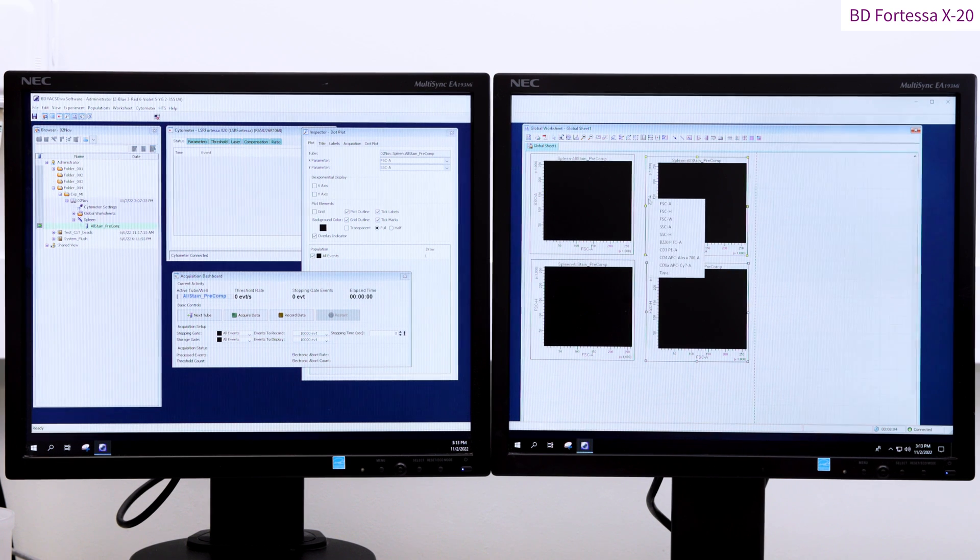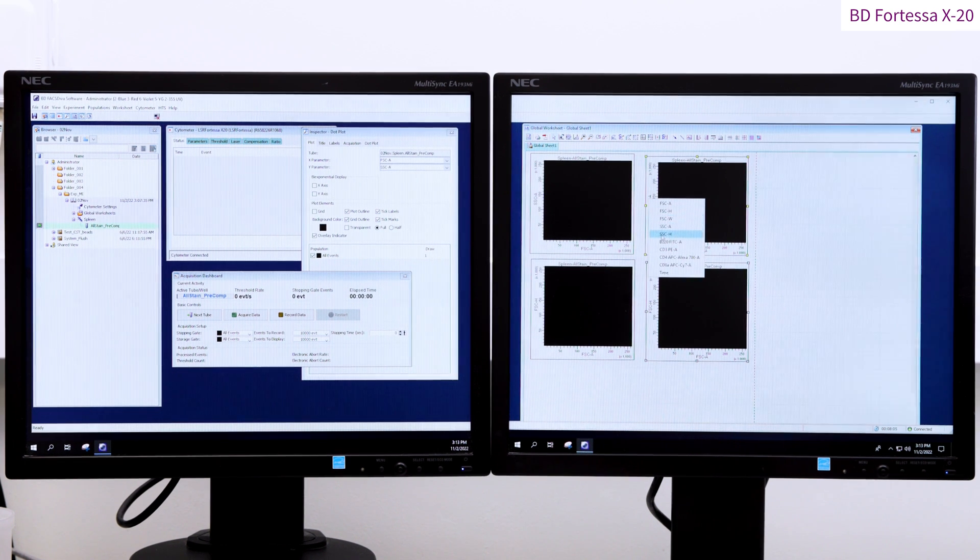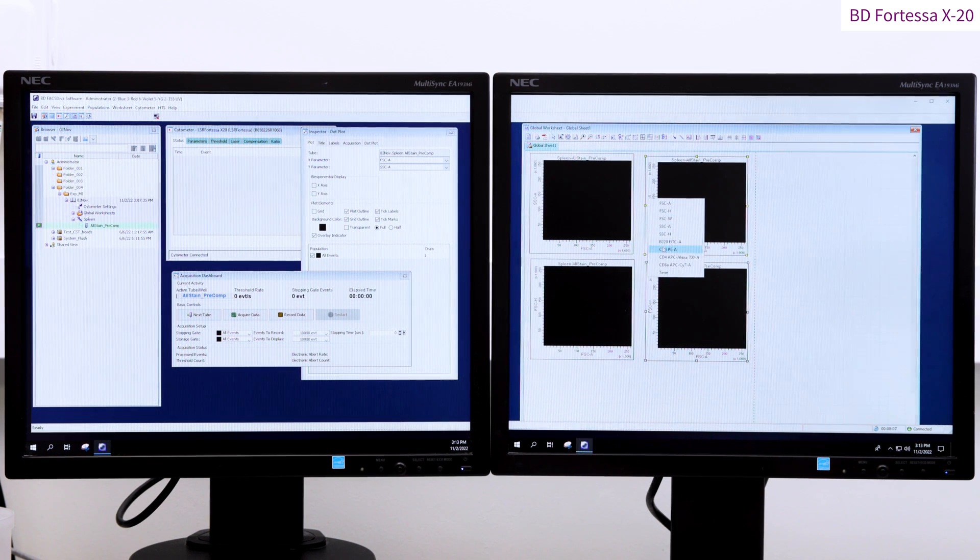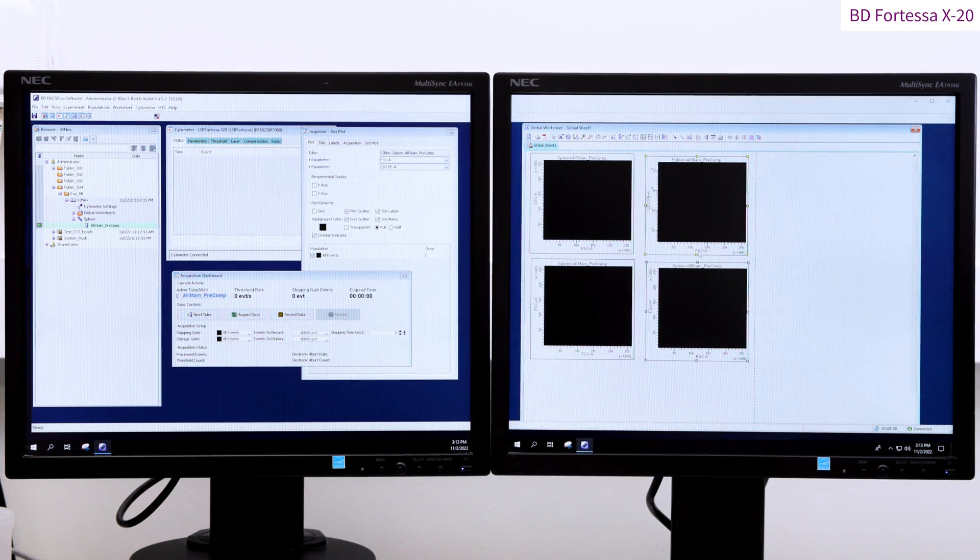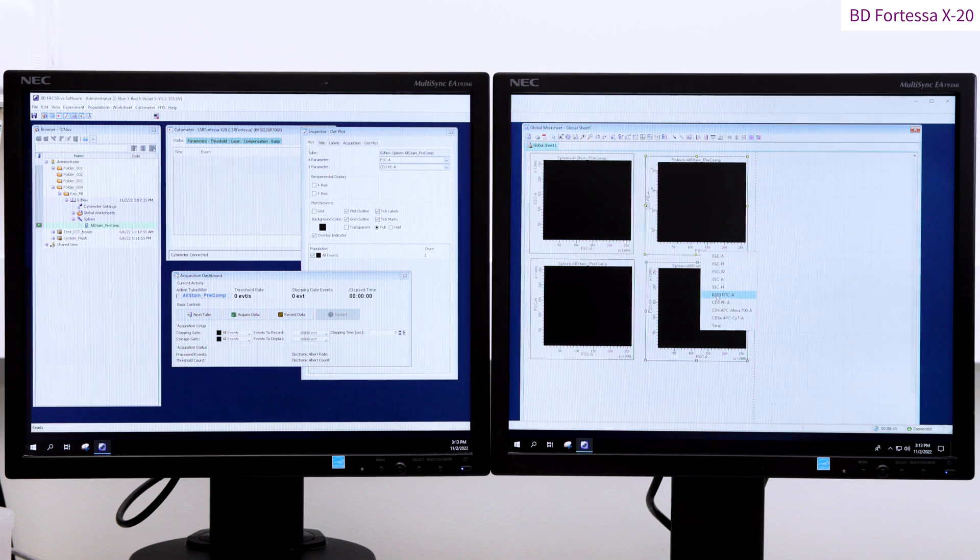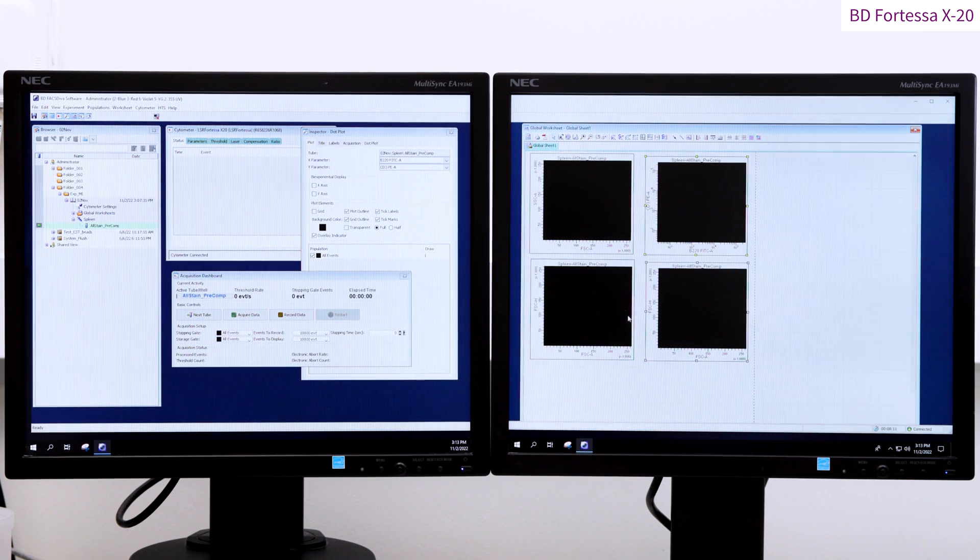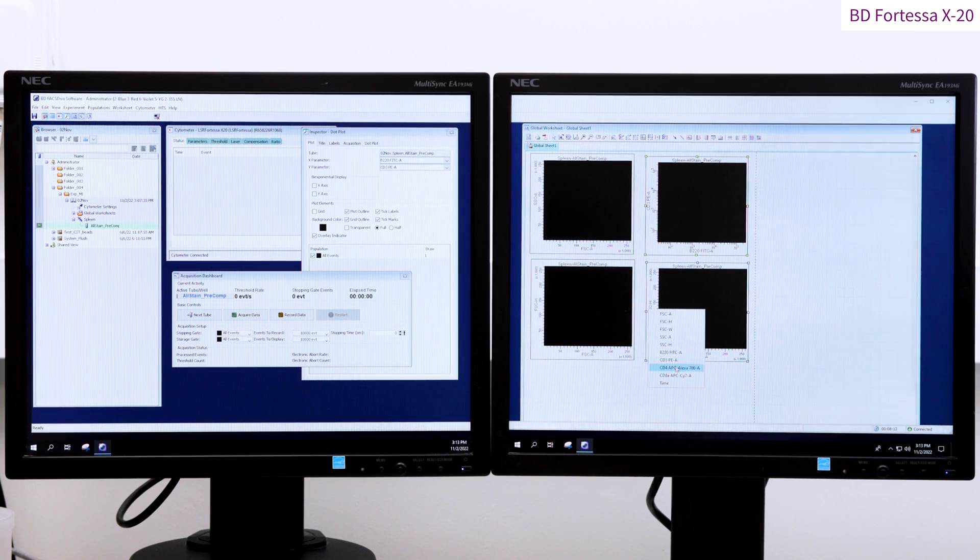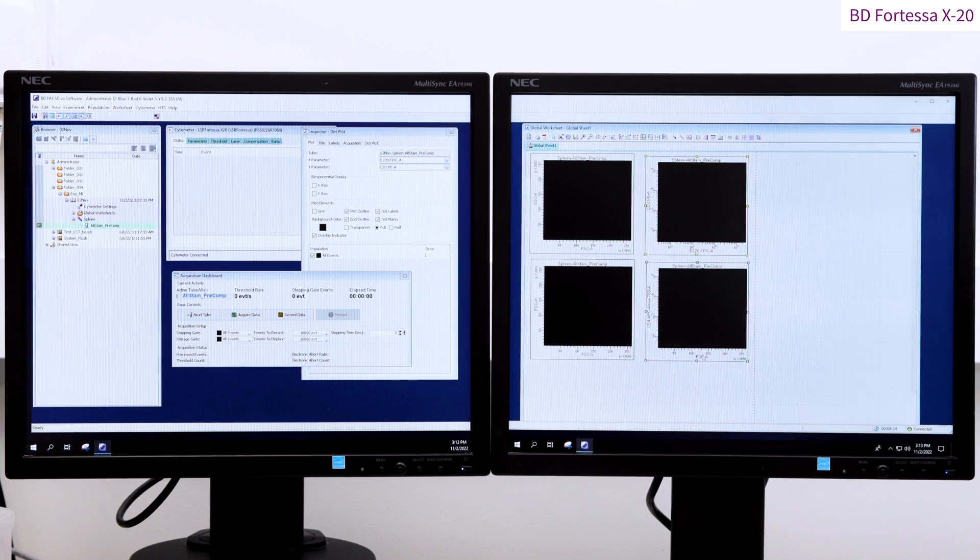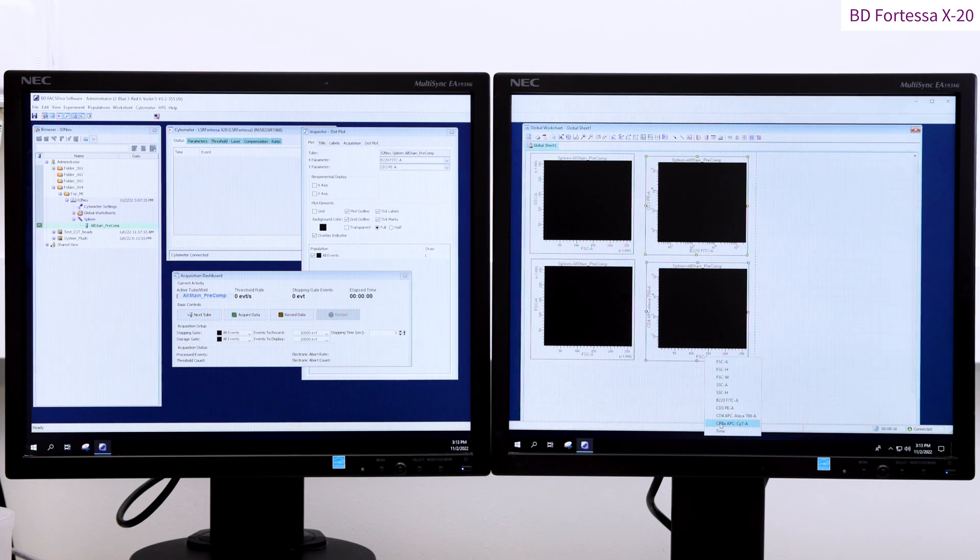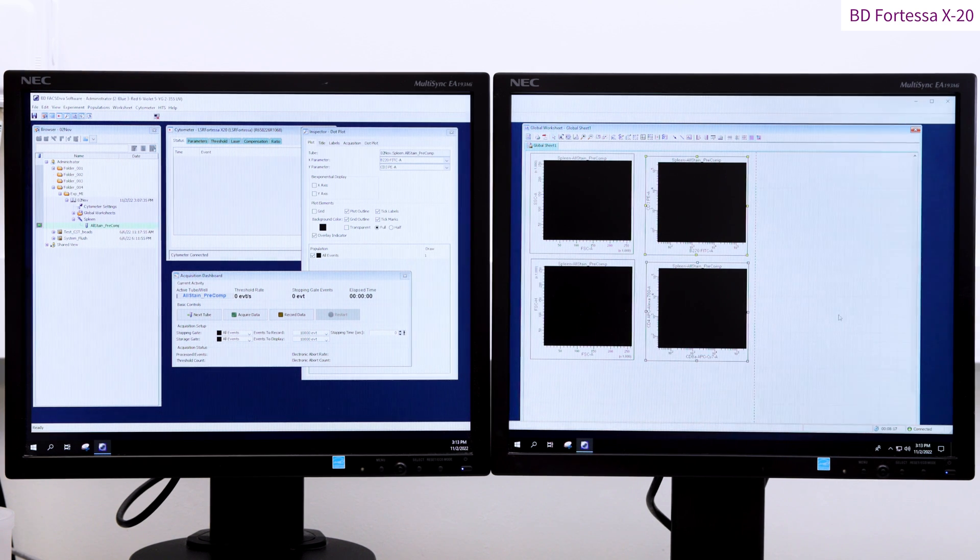To help with your analysis, you can rename the parameters. So today we've got B220 FITC, CD3 PE, CD4 APC AlexaFluor 700 and CD8 APC Cy7.